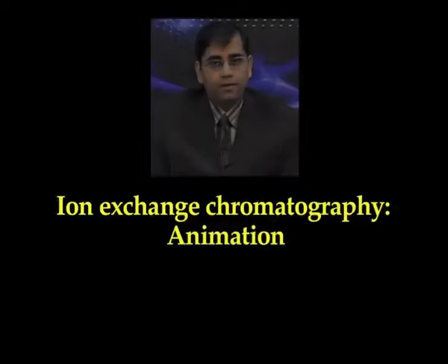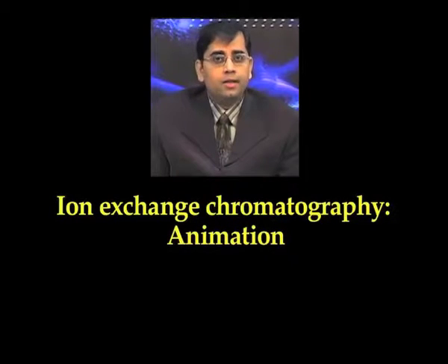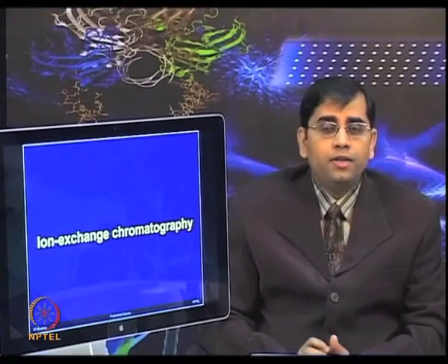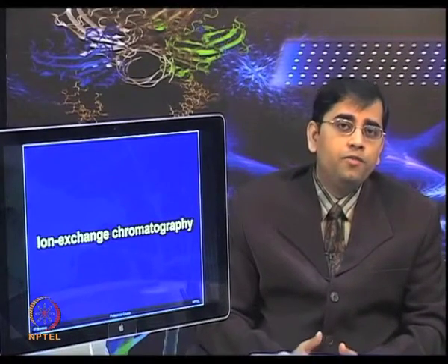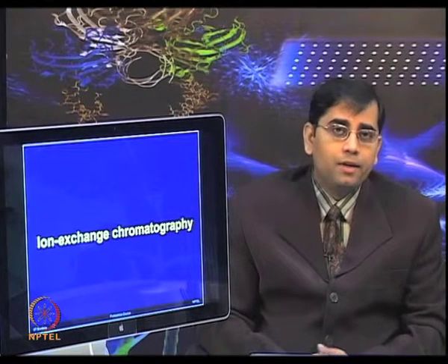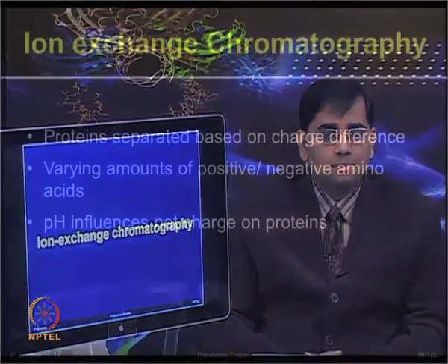Ion exchange chromatography. This is one of the most versatile chromatographic separation methods, which relies on differences between the number of charges and distribution of charge groups in defined pH and solvent conditions.